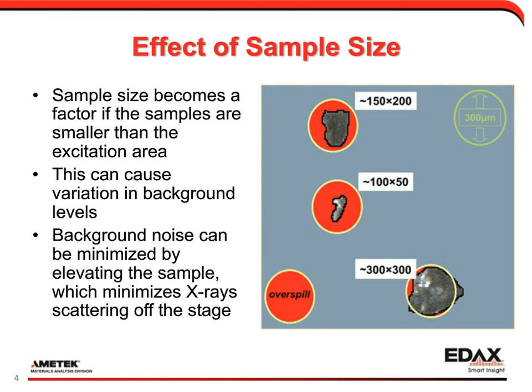With polycapillary optics, which have a beam diameter of 30 microns at Mo K full width half max for the Orbis PC, this issue can be minimized due to the smaller beam diameter. But as the beam diameter increases, more typical with a monocapillary, which can go up to 300 micrometers in diameter, this effect might become more significant.